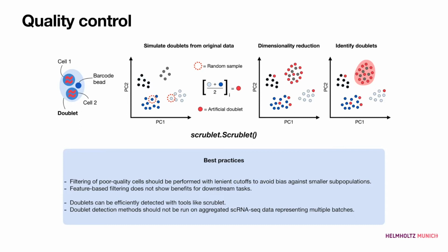So if you want to simulate the doublets adequately, you need to consider this in your simulation, because it considers the actual ratio of cells in every cluster to simulate the doublets, and you don't want to mess this up by presenting data in a way that couldn't occur in real life.